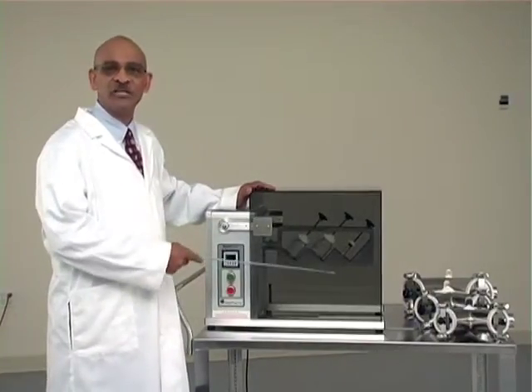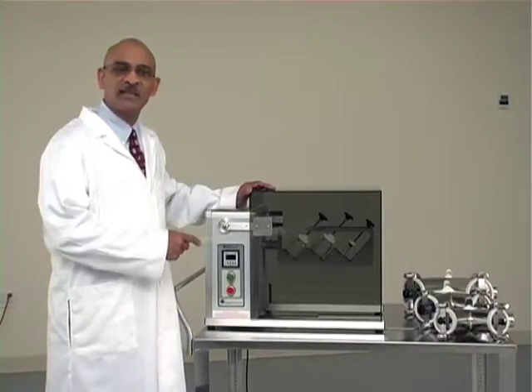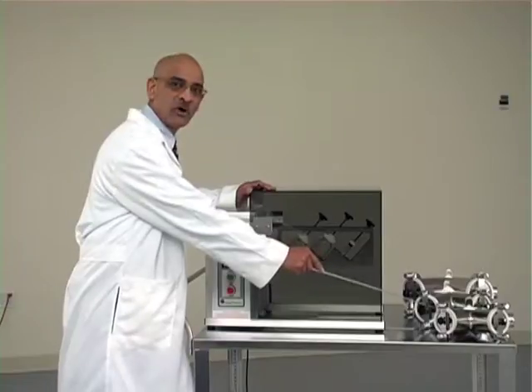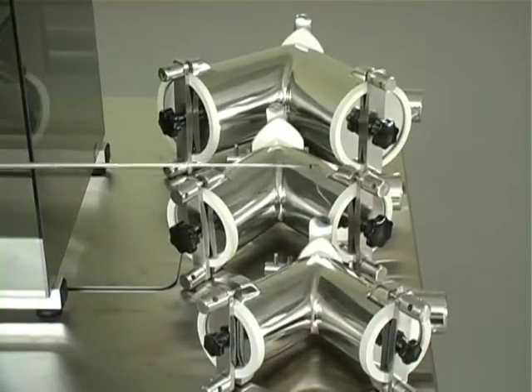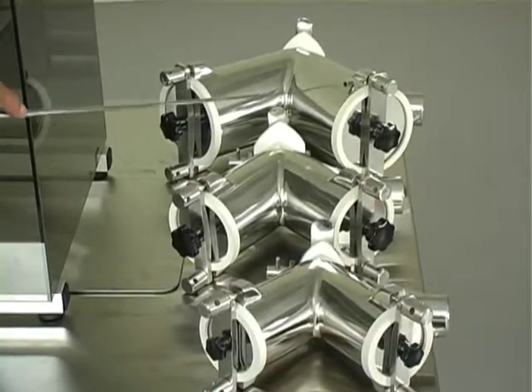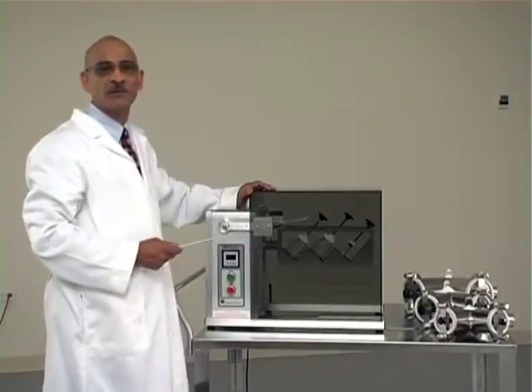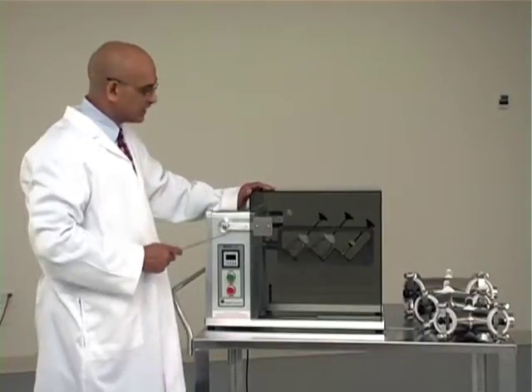The second attachment that can go on here is a V-shell. There are 3 different sizes of V-shells that can be accommodated by this machine: the half quart where you can make 250 grams of blend, one quart where you can make about half a kilo of blend, and the largest is 2 quart where you can make up to 1 kilogram of the blend.